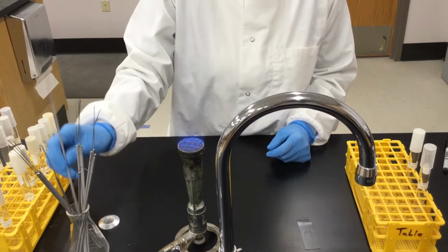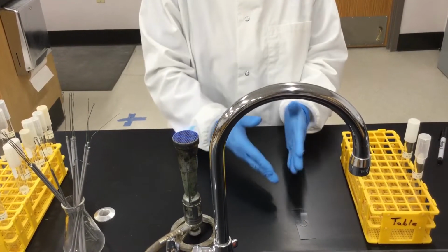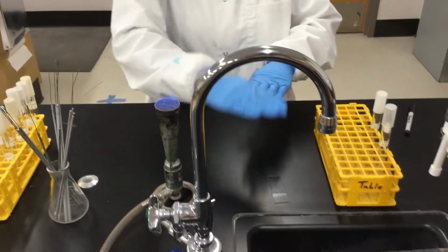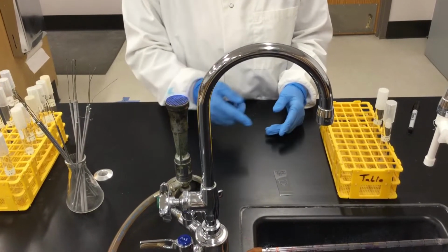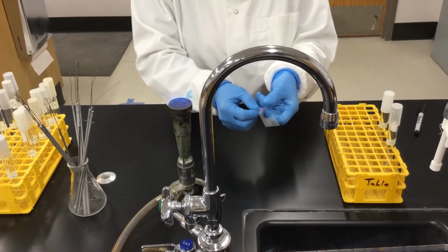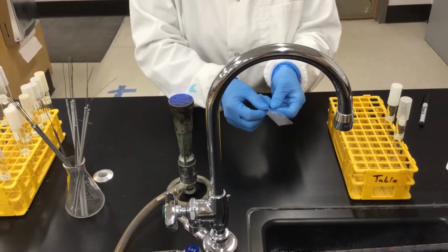So I'm going to put the loop here as I'm waiting for this to dry. And again, this is one of the things that takes a while. And of course, the more that you spread the film, the less time it takes to dry. But for me, that's enough. It's almost dry. I can see it, and I will show you a close-up of how it looks once it's dry.